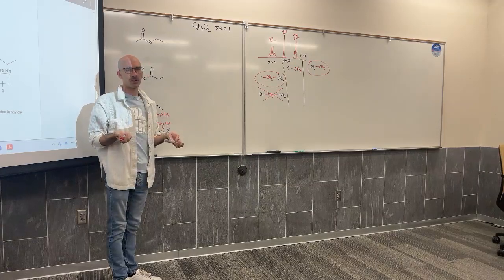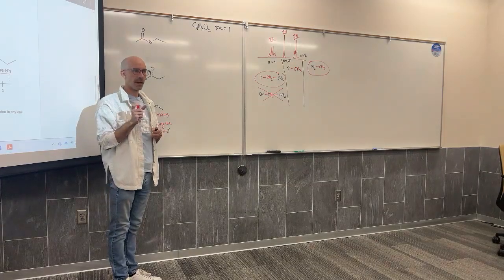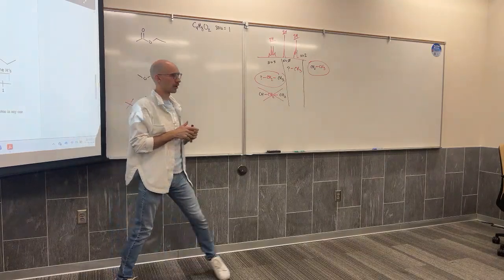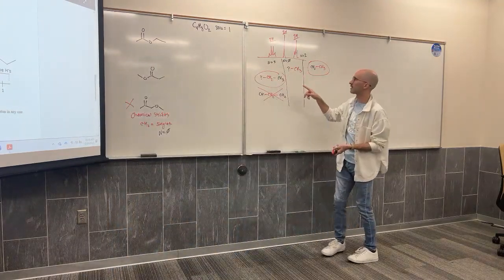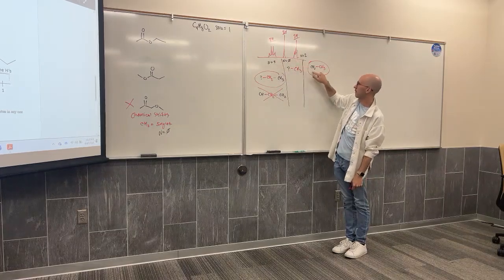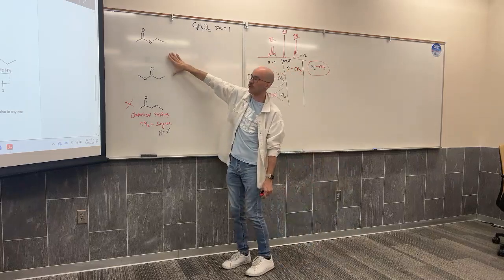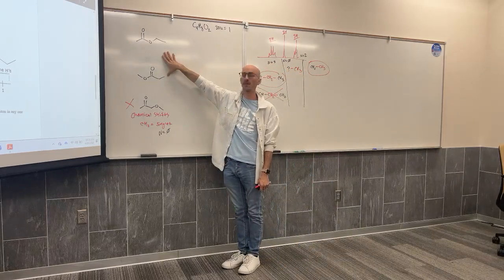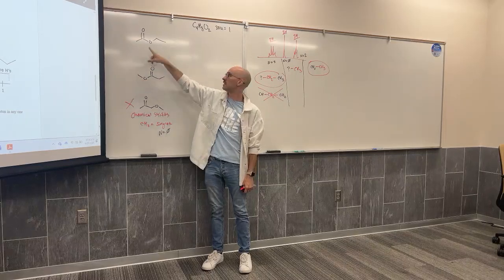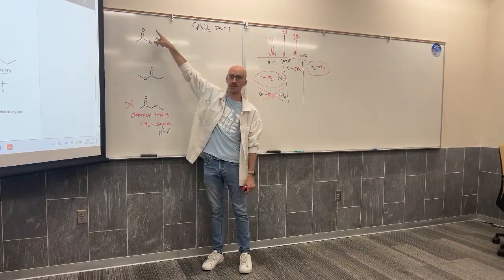Doesn't help me fill in much though. So I'm going to have to go back to relying on chemical shift a little bit more. So far, what we've analyzed: a CH2 with a CH3 neighbor and a CH3 with no neighbors. Those are both present here. CH3 with no neighbor, CH3 with no neighbor. CH2 with a CH3 neighbor, and a CH3 with a CH2 neighbor.